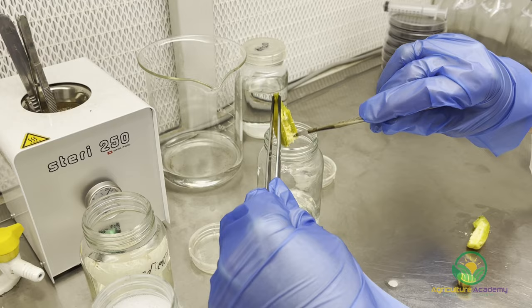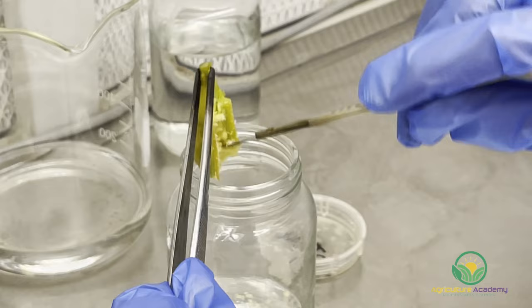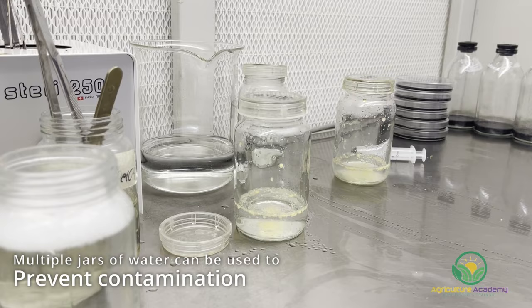To wet flask, the seed was dusted into jars of distilled autoclaved water. We use two jars to prevent contamination. In this case, if one jar gets contaminated, at least the seed in the other jar will still be sterile.